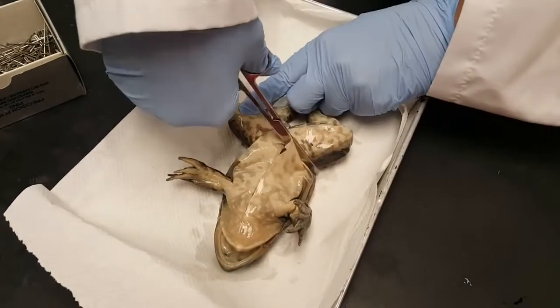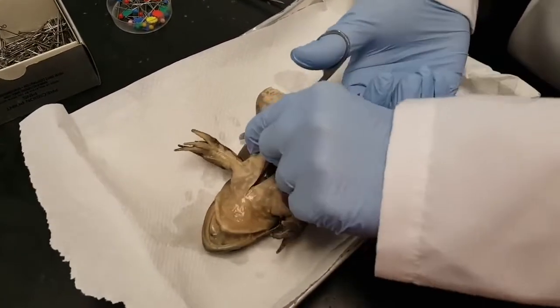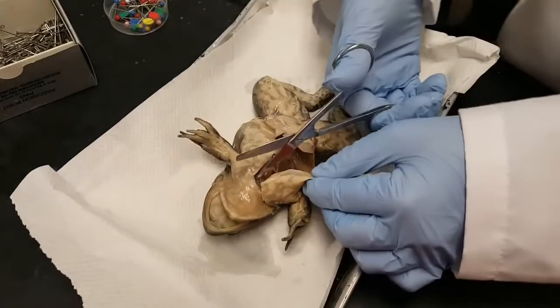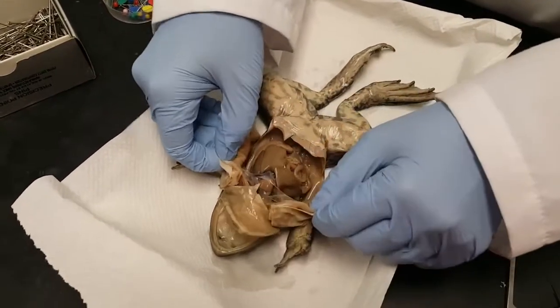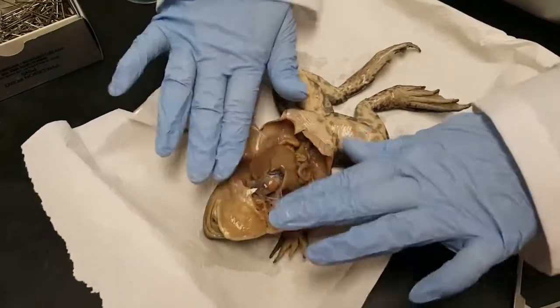Then I'm going to go this way, then I'm going to go this way, and then I'm going to cut this way by the mouth, and then I cut this way. And basically that means you can now open it like a door.